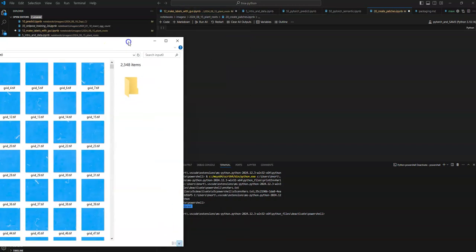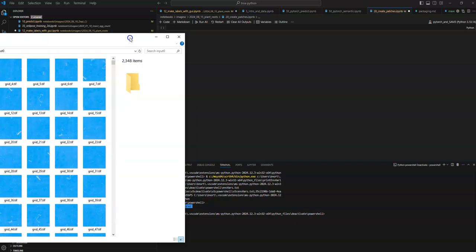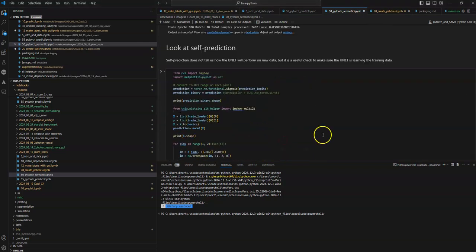So if I want to compare CellPose and Stardist, I could keep the augmentation constant and just test the different network architectures, instead of, if the augmentation is built in, you're kind of testing the augmentation too. Okay, so now that we have all these patches, we can train.